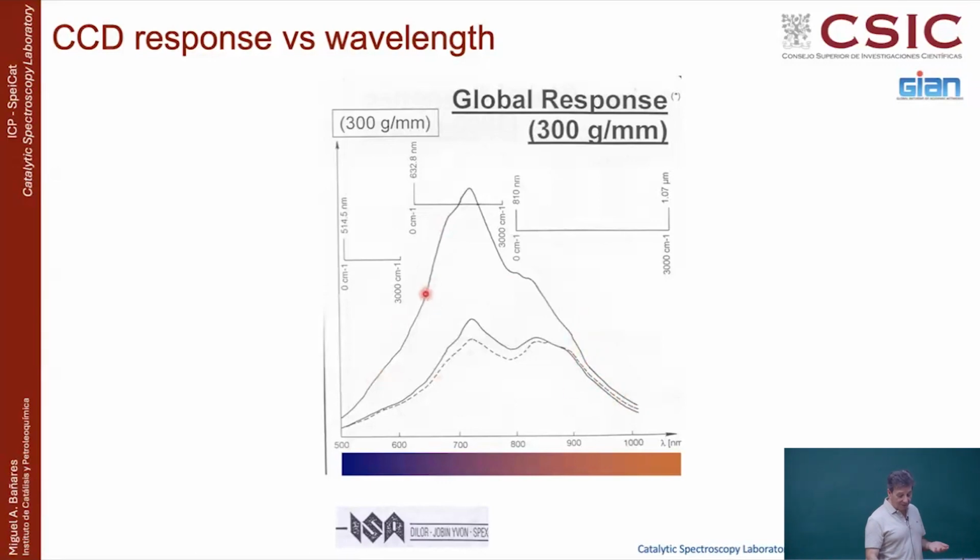Over here, this is okay because, although the detector becomes weaker and weaker, as you go to the blue the Raman effect is stronger and stronger. So you get a stronger Raman effect that compensates for the lower sensitivity, because there are many more Raman photons. If you go to the UV, this detector doesn't see UV photons, but usually it comes with a coating that converts every UV photon into a visible photon and will read without a problem. Now, if you make Raman with infrared, you see nothing, and then they use a different kind of technology.